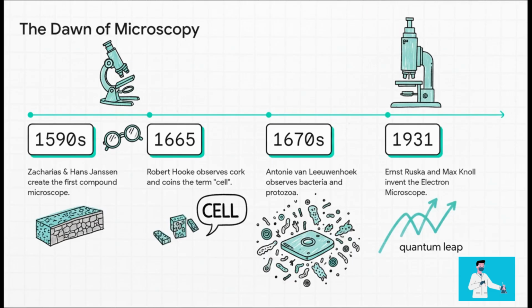And then things kind of stalled for a bit. For over 200 years, progress was pretty slow. Until 1931 and the invention of the electron microscope. I mean, a true quantum leap that changed science forever.